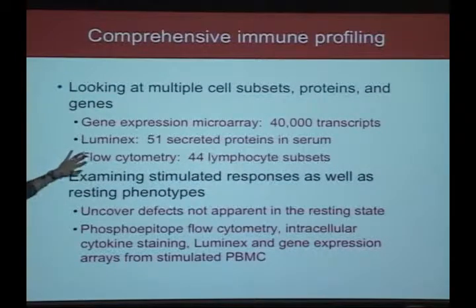And actually now with the CyTOF replacing flow cytometry to some extent, we have many, many more subsets that we look at phenotypically and functionally.